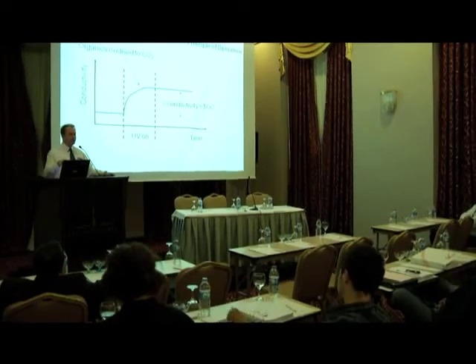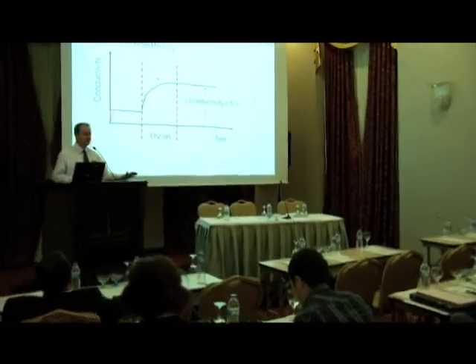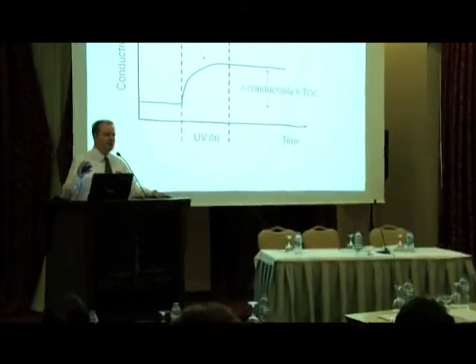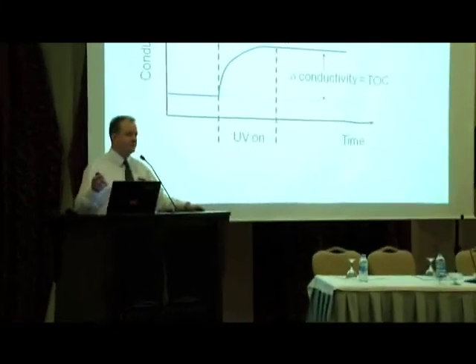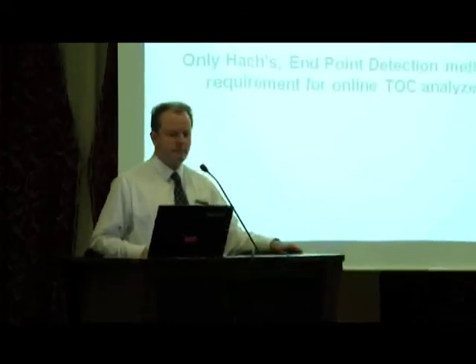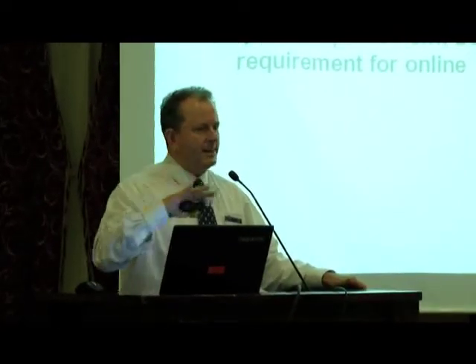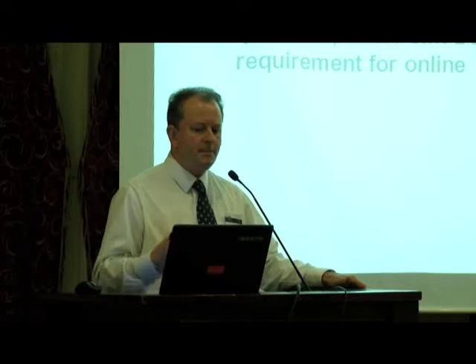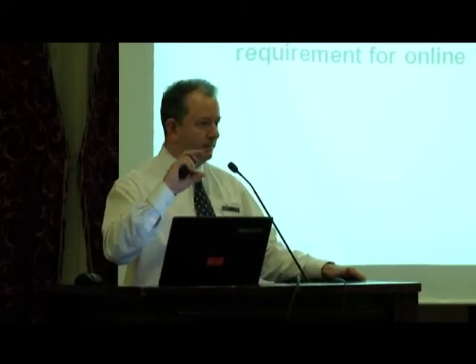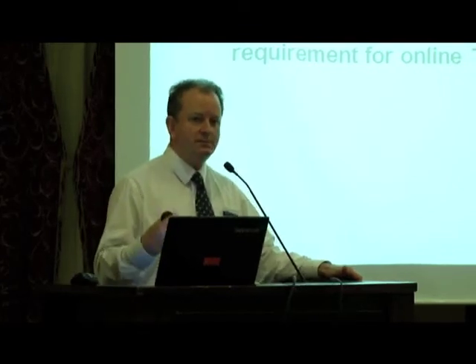So you see, conductivity is the fundamental measurement we're doing with these TOC analyzers. All the TOC analyzers that you see on a pharmaceutical grade water system will use conductivity. Now, because we are breaking the organics down to carbon dioxide and then measuring that change in conductivity, it's important that we completely oxidize all of the organic material to make that measurement.